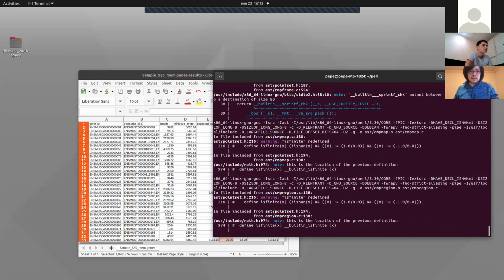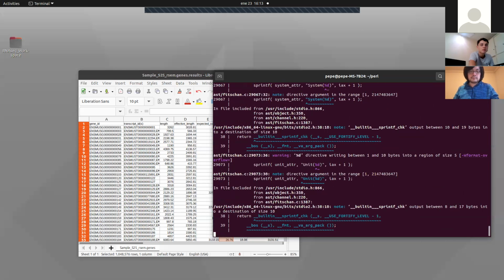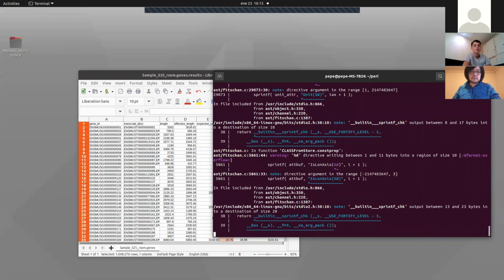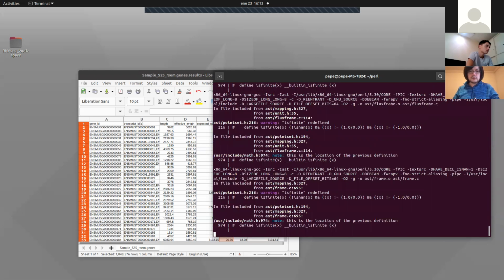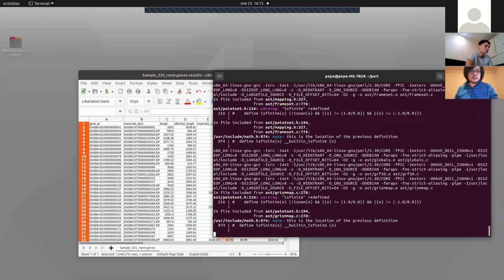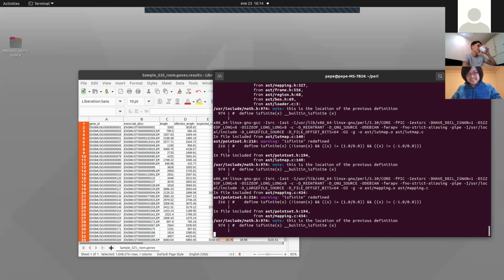Fantastic, so it will be easier to analyze. Will it help with the gene name as well? Yes, we just need to give it the file that has the gene names, the GTF file. So it will do everything, I think. That's how I like it.